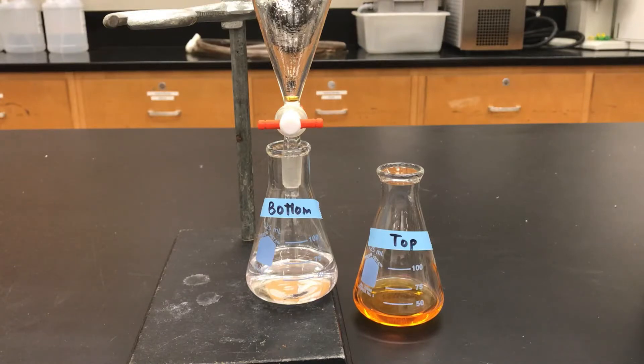This is where I ended in the last video. I had the methyl red mostly extracted into the top layer, making it orange, and the bottom layer looked pretty clear, so there weren't as many methyl red molecules left. But there really could be some left, and not everything is going to have the same sort of distribution as methyl red.